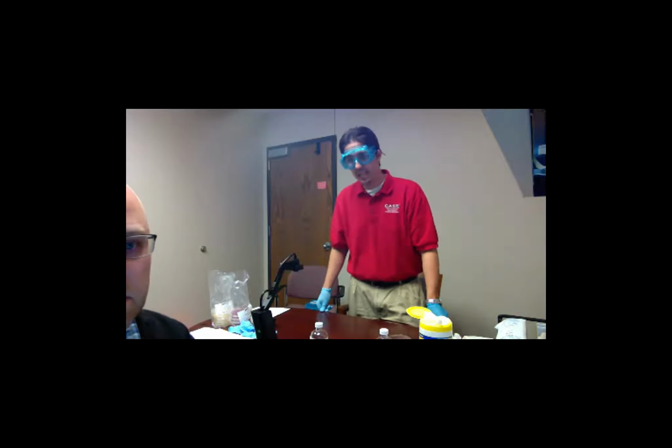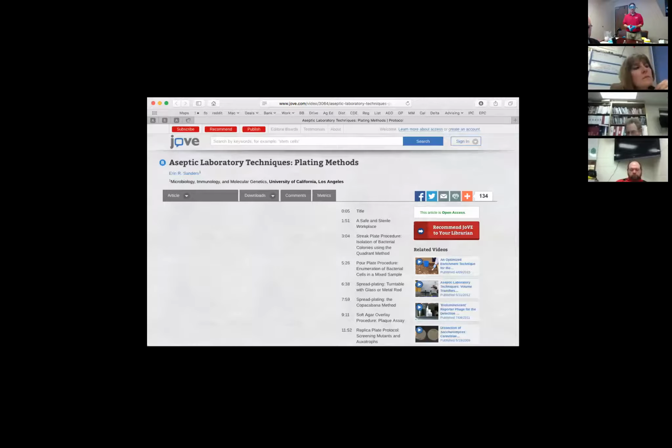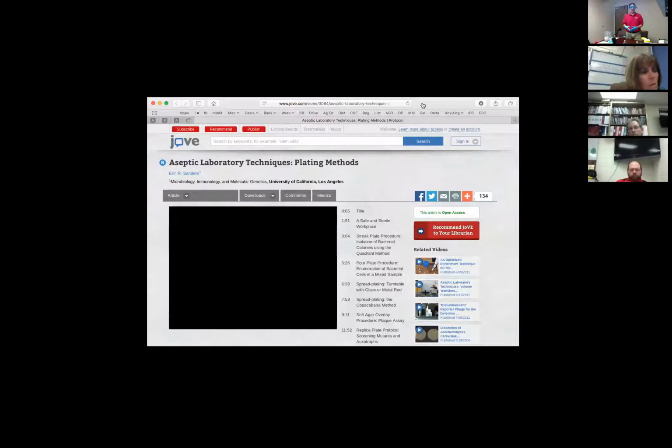You have these clips if you want to go back and use them in the classroom, which I think would be a great idea. They're both very short clips. I believe they're both under 2 minutes, 1.5 minutes. Matt, if you would click on the spread plating, that's right there, yes. Okay. This is the spread plating. This one's actually longer, but we're not going to watch all of it.